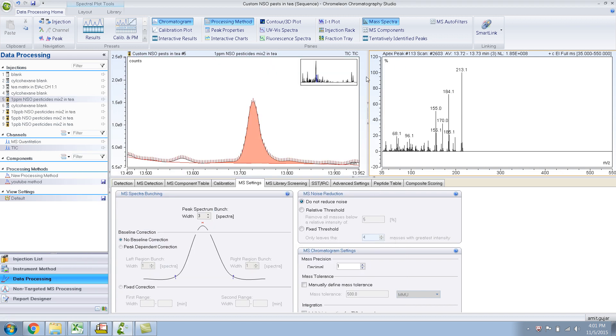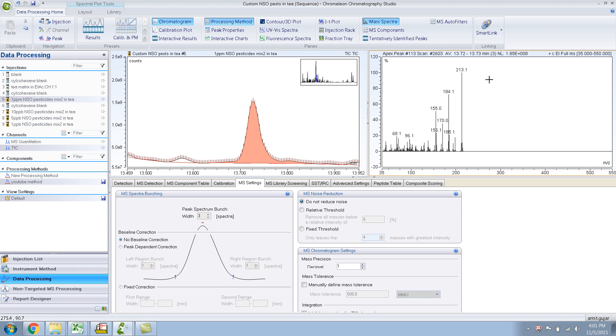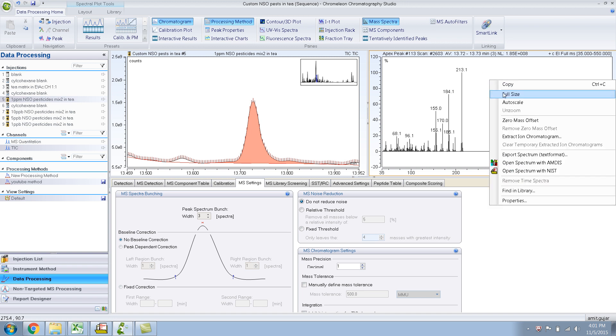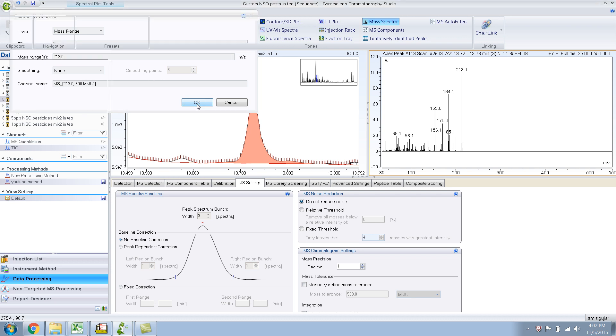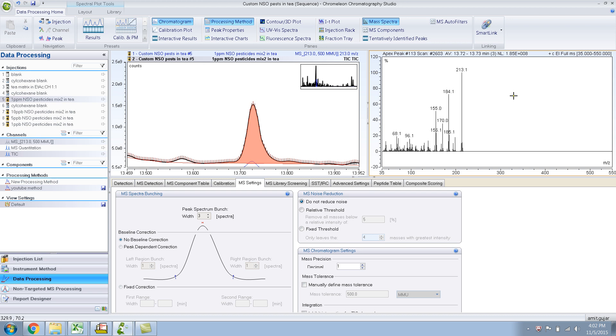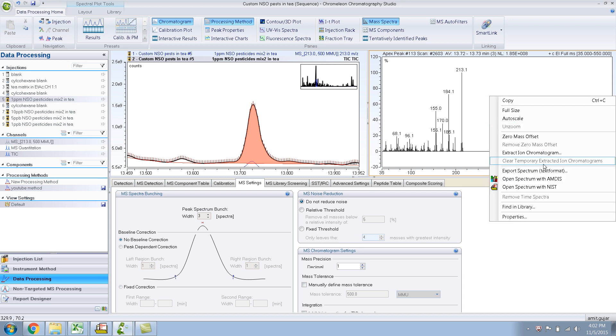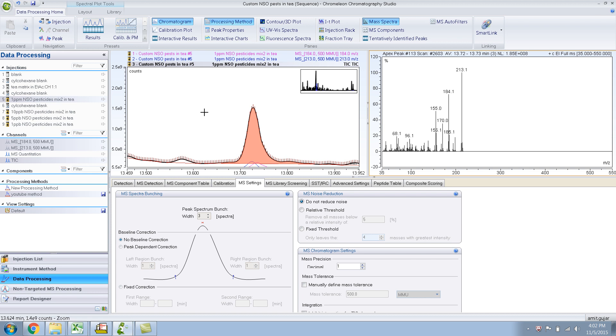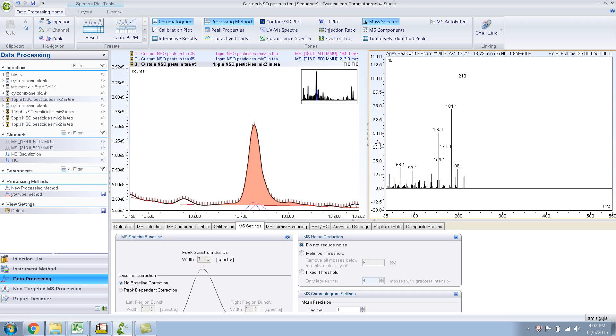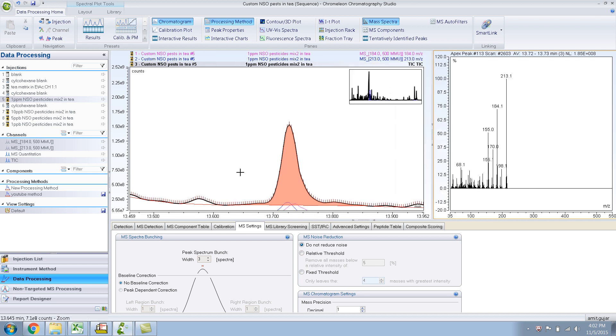And in one of the earlier videos, I had extracted 184 and 213, so let me do that again. So let me extract ion chromatogram 213, and let me extract 184.